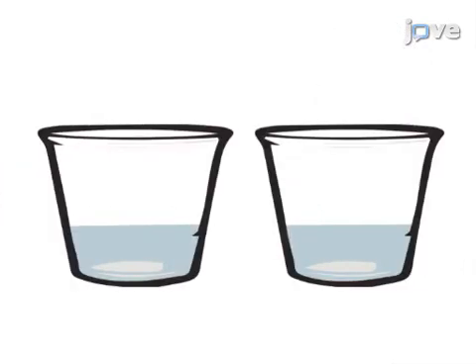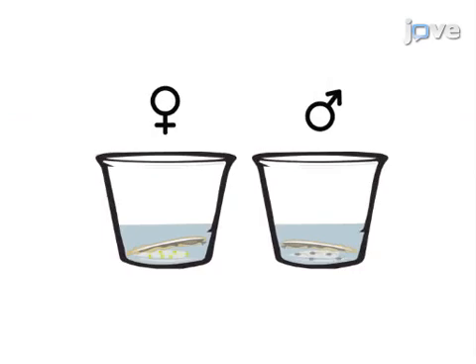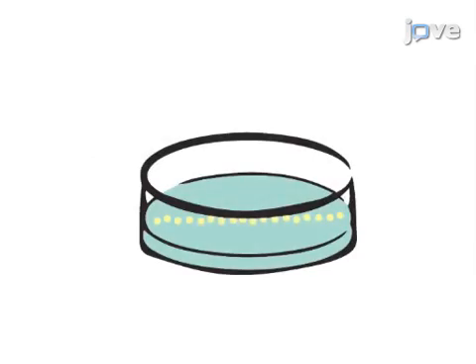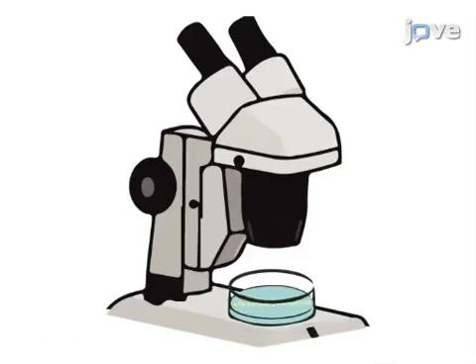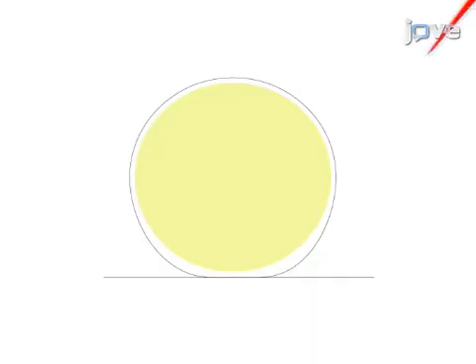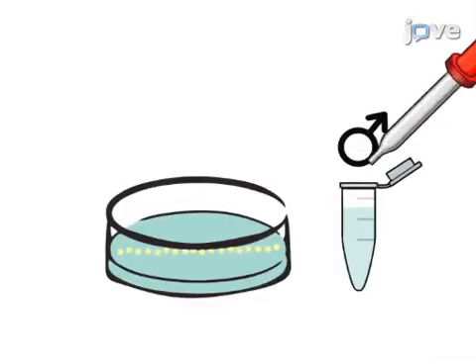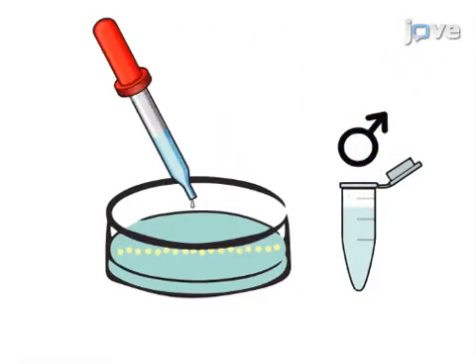Following the temperature shock, females and males are placed into individual spawning cups, allowing the collection of, respectively, oocytes and sperm. Once the oocytes are lined up in a polylysine-coated dish, a specially prepared microinjection needle is used to inject solution inside the core of the oocyte. The final step is the fertilization of the oocyte with 1 to 5 drops of sperm.